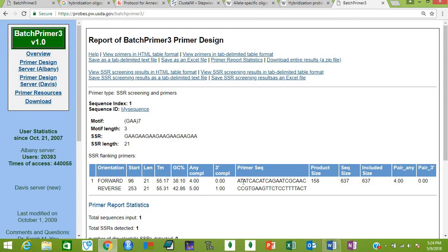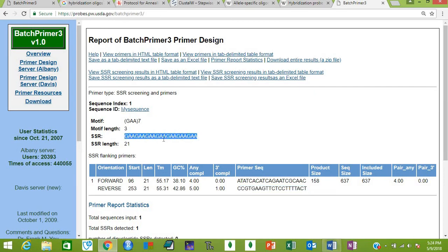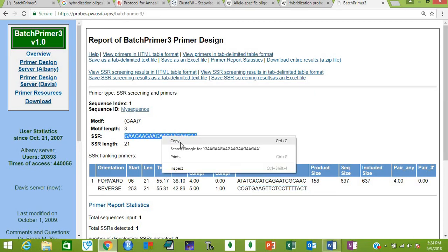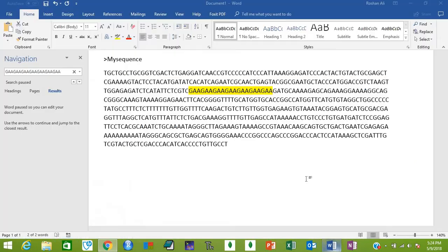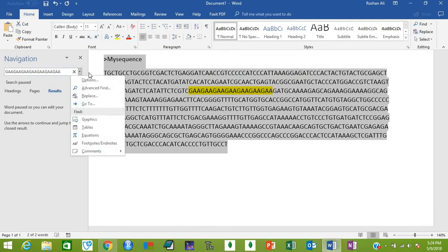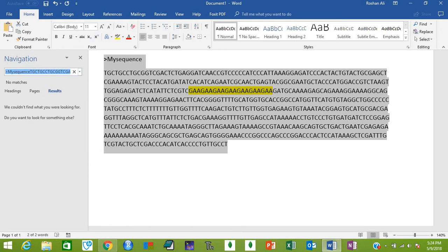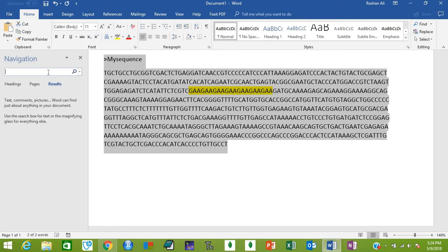Now let's check if these results match our sequence or not. First of all, copy this SSR and find it here in your sequence. Just press Ctrl+F, remove this, paste the copied SSR, and then press Enter.